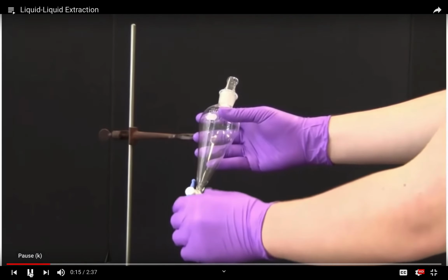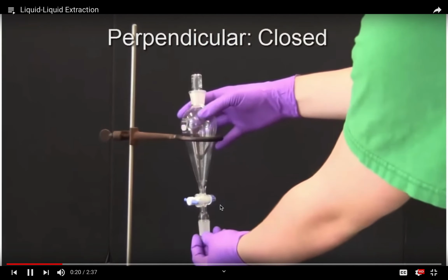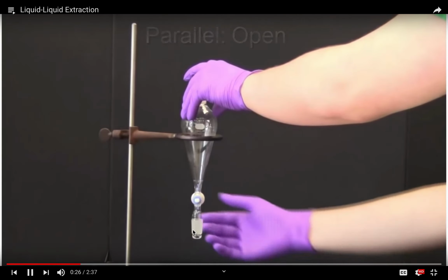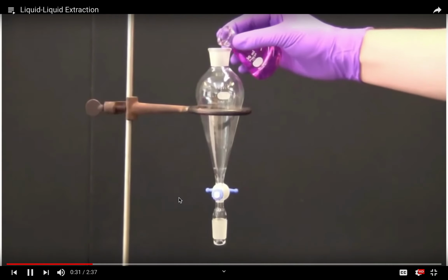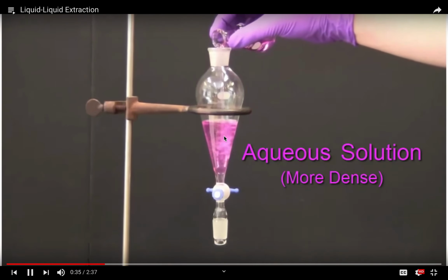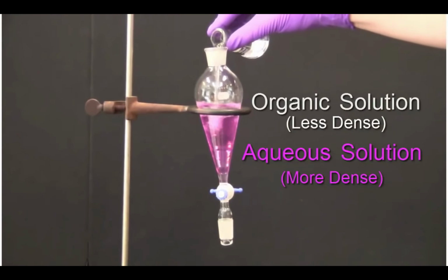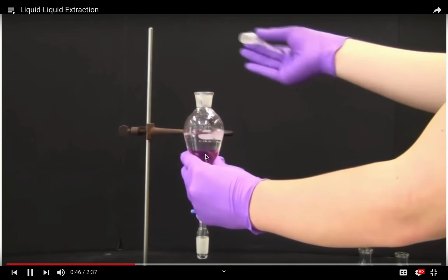The first thing you should be careful about is that the stopcock should be in the perpendicular position. It should be closed when you add your organic solvents. When it's parallel, it's open. When it's perpendicular, it's closed. So the first addition is the aqueous layer, which is more dense in this case, and it's pink for visualization. In our case, it will be colorless, maybe. Then the organic solution is added.